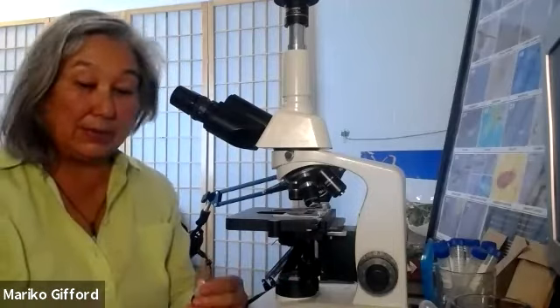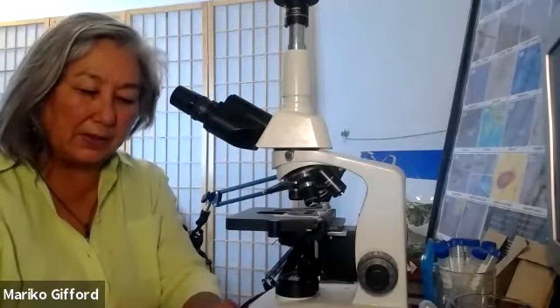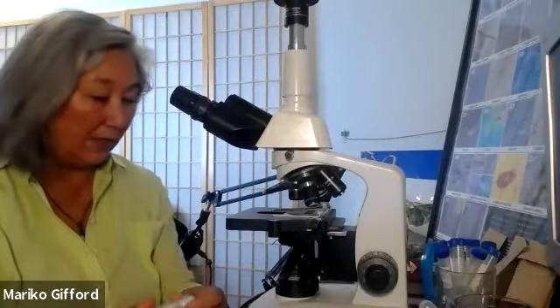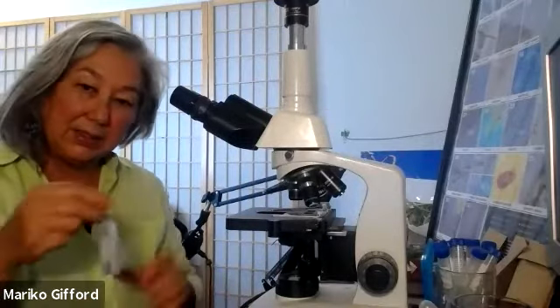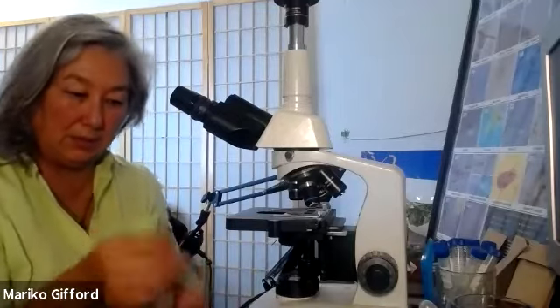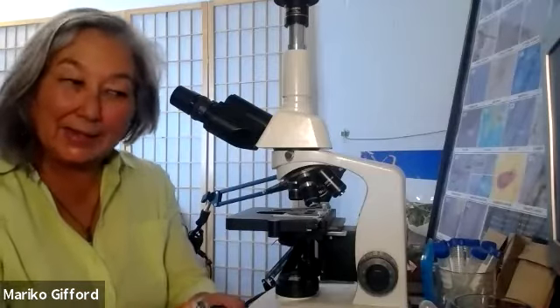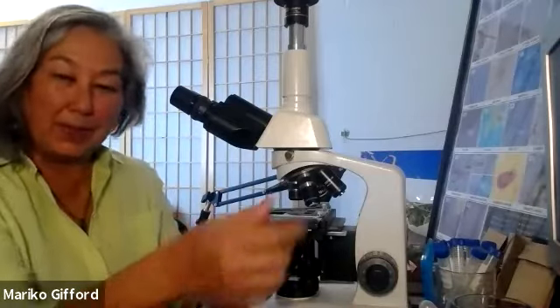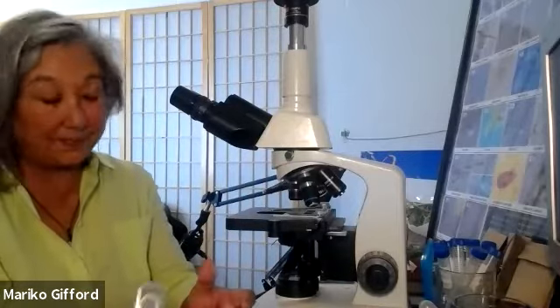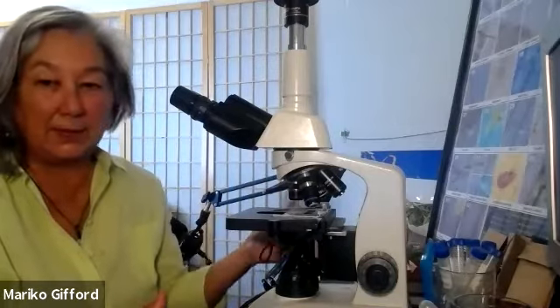It's pretty inexpensive. I believe this one was like $45 or $50, where this one, just for the microscope, was between $400 and $500. And this you take out to the field with your handy little tin with slides and slide covers, and your little water, your pipettes, and right there you're good to go. You can look at it right on the farm. I was really surprised, but also very impressed that somebody is figuring this out.